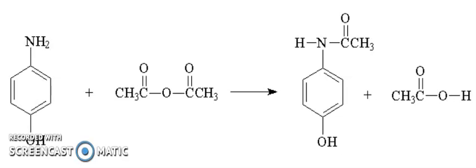So in this synthesis, we are going to synthesize one important analgesic compound. Analgesic compounds are used to reduce pain. Antipyretics are compounds used to reduce fever. One popular drug that is both is aspirin, you also know that.